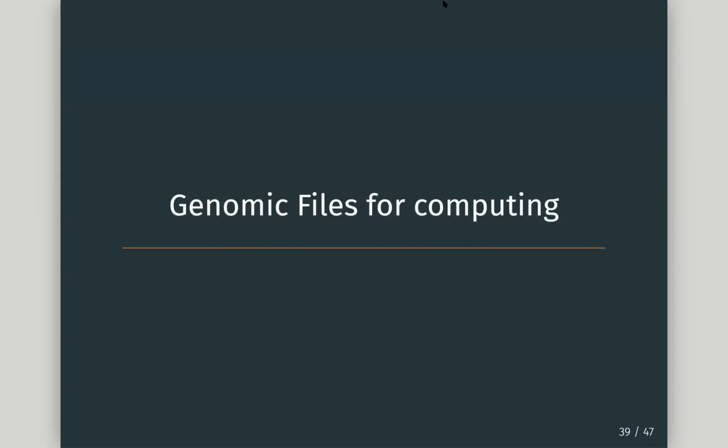Okay, so I've talked through all these different formats. I'm sorry, I'm just running out of time a bit. We've talked through all these different formats. Sorry.